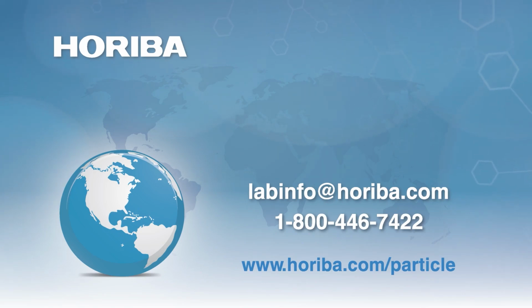Yeah, okay, good question. The short answer is the Aquaflow. So the most popular system is this 180 to 250 ml aqueous-based systems. That's always an interesting question because it's kind of like, where do you start when you don't really know what's going on? If you already know everything about your sample, it's pretty easy, but when you're stumbling around, where do you start? And this is really where I start. I like water, and I will try to find a surfactant system so I can avoid using solvents.